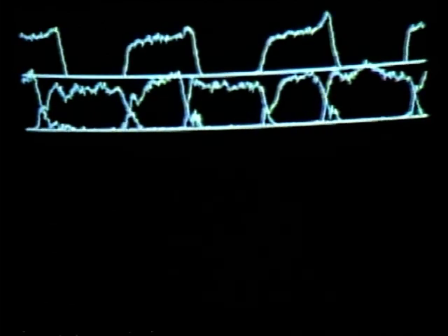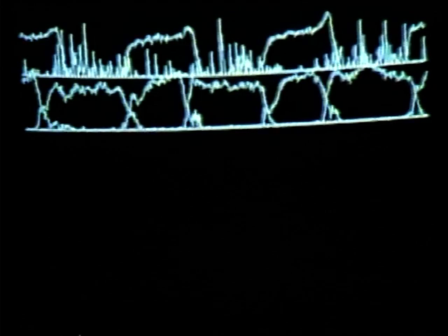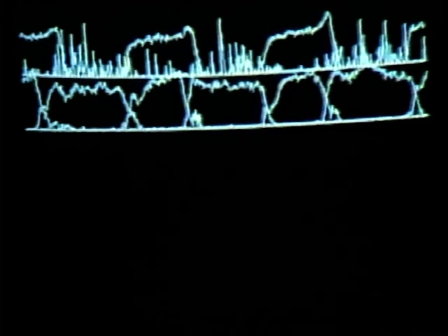Let's also look at line number 1. Function key number 2 and typing in line number 1. Region number 3, we can display add. Let's include line number 1, region number 1, function key number 3 to change the region, region number 1, display add, which is soft key number 2. This was the gold, which we saw little or no signal of gold on line number 1.